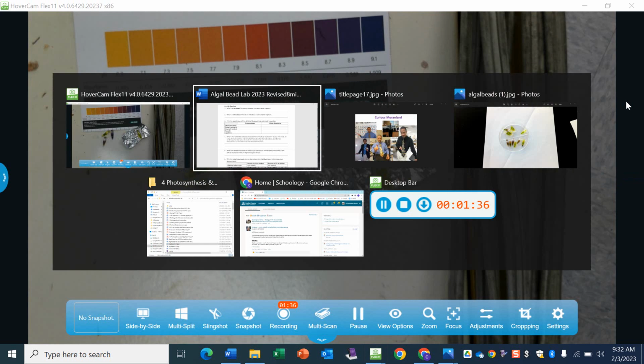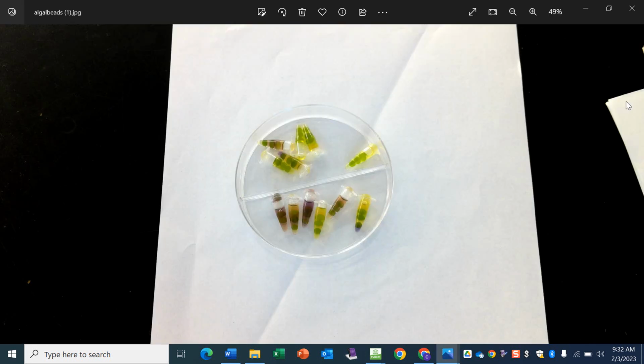All right, and this is just a screen capture from before. If you look and you see all the ones that are purple, that's photosynthesis that's taking place. This is not. So raising the pH, lowering the pH. So the challenge questions we're asking the students is, when is photosynthesis taking place, and how are we measuring? We're using pH to do that.